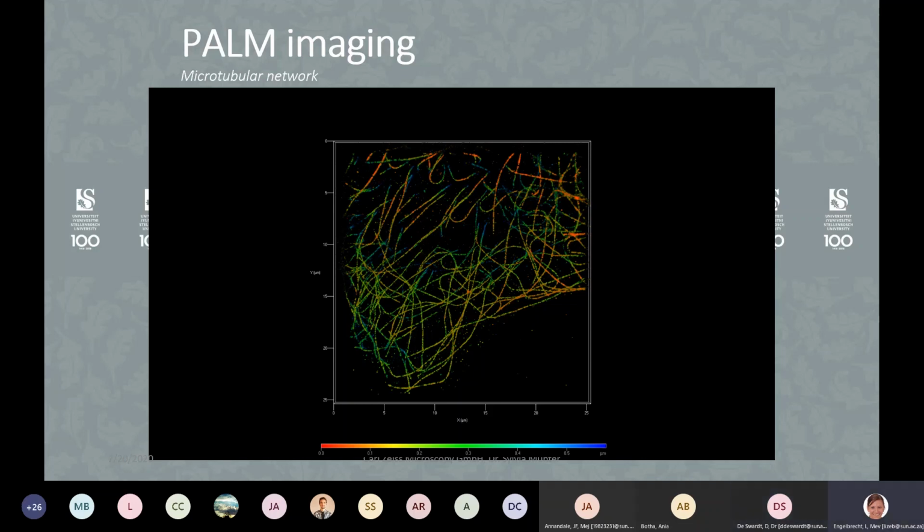Right. I also saw something here. Could you re-explain the Z point or Z plane? Right. I'm going to explain it in terms of the point spread function. When you have a nice, more or less round fluorophore, that round fluorophore will not look like a sphere on a confocal microscope or any light microscope. It will look like this elongated shape. That's just how it will always work. Because of the limit of resolution and the way it's excited, it will be elongated in the direction where the light is coming from. So when I talk about the Z plane, I'm talking about the elongated part of the point spread function, where the X and Y is the shortest plane from left to right.